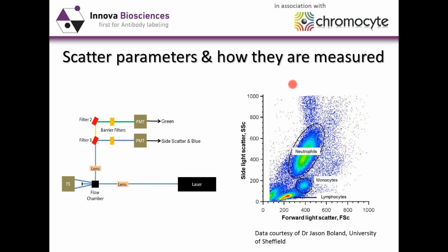And he was interested in examining the effect of opioids, so analgesic pain-killing drugs, on immune function. And part of his work was to analyze the effect of opioids on the phenotype, so cell surface expression, and also function of neutrophils, monocytes, and lymphocytes.